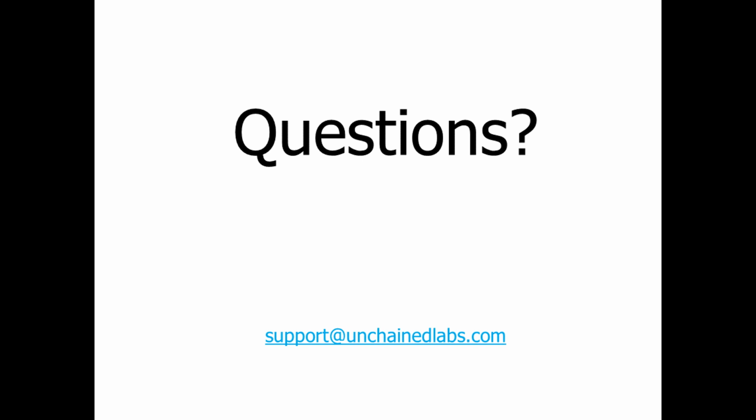Thank you. And our next question, let's say you have multiple systems, for example, one for powder handling and another for liquid handling. How would Design Creator work if you had to break down tasks across multiple instruments? So at the moment, Design Creator works with one library design per system. In current versions of Library Studio, you can set up a workflow where you end up using multiple systems as part of that. At the moment, Design Creator is not compatible with that.